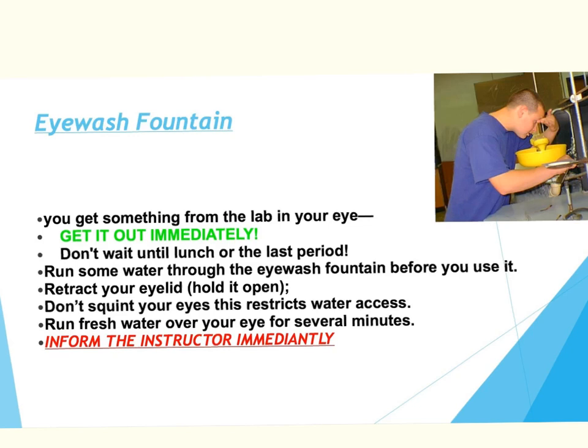The eyewash fountain is set up so that you can get a chemical out of your eyes immediately. We don't want you to wait until lunch or the last period if you get a chemical in your eyes. Immediately run the water through the eyewash fountain and get that chemical out. Inform the teacher immediately and we will help you.